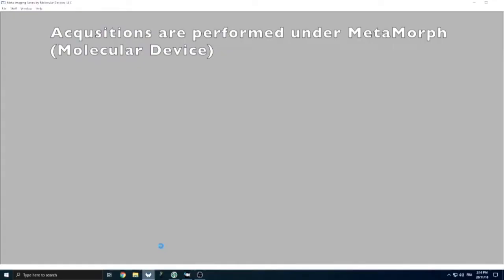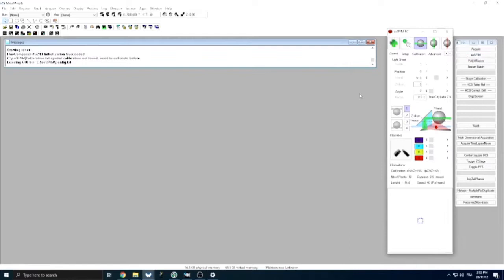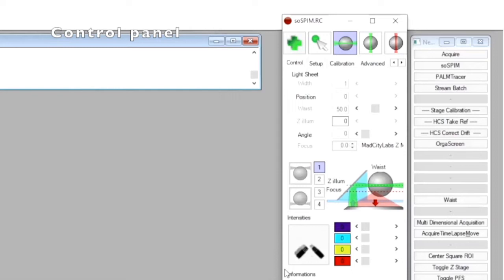We then open the acquisition software Metamorph and start the soSPIM plugin. The soSPIM software is composed of several panels: the control panel, which allows controlling all the light sheet parameters such as its width and its 3D position. This panel also enables selecting the laser lines we want to use and adjusting their intensities. In our case, we have four laser lines at 405, 488, 561, and 640 nanometers.